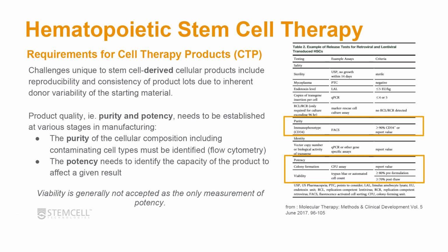Usually doing the clinical trial allows you to really identify the ranges that are acceptable for the purity of something like this. With regards to the potency, the viability has been identified as being required, and in this case, greater than 70% post-thaw, very specifically using trypan blue.